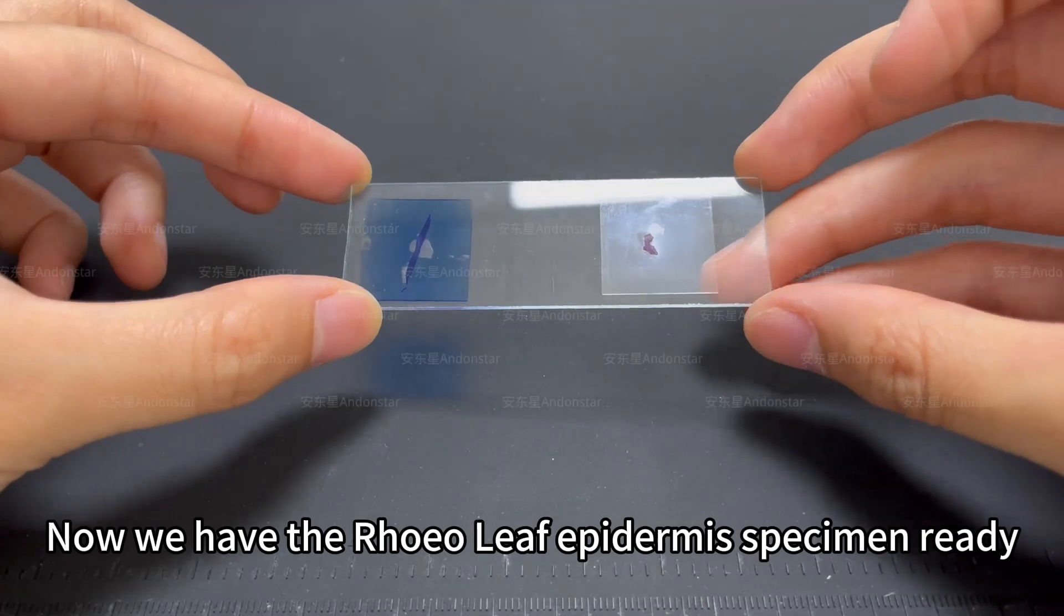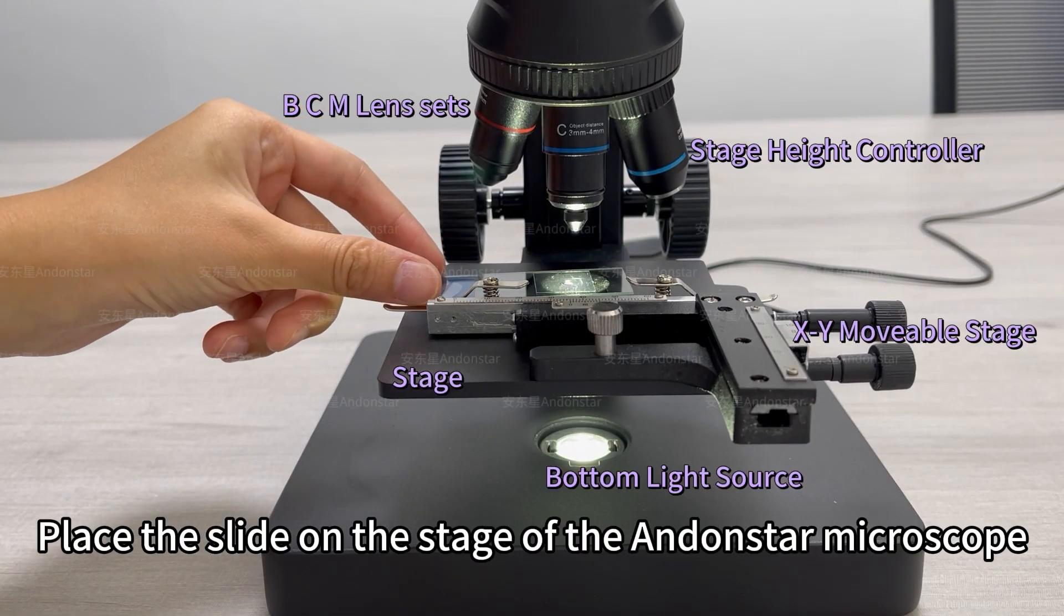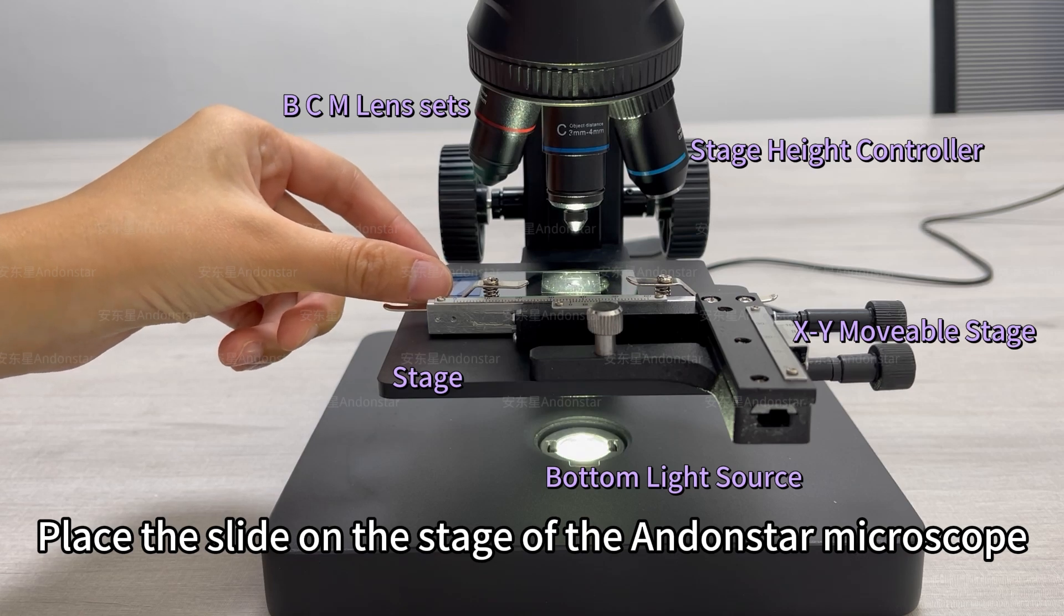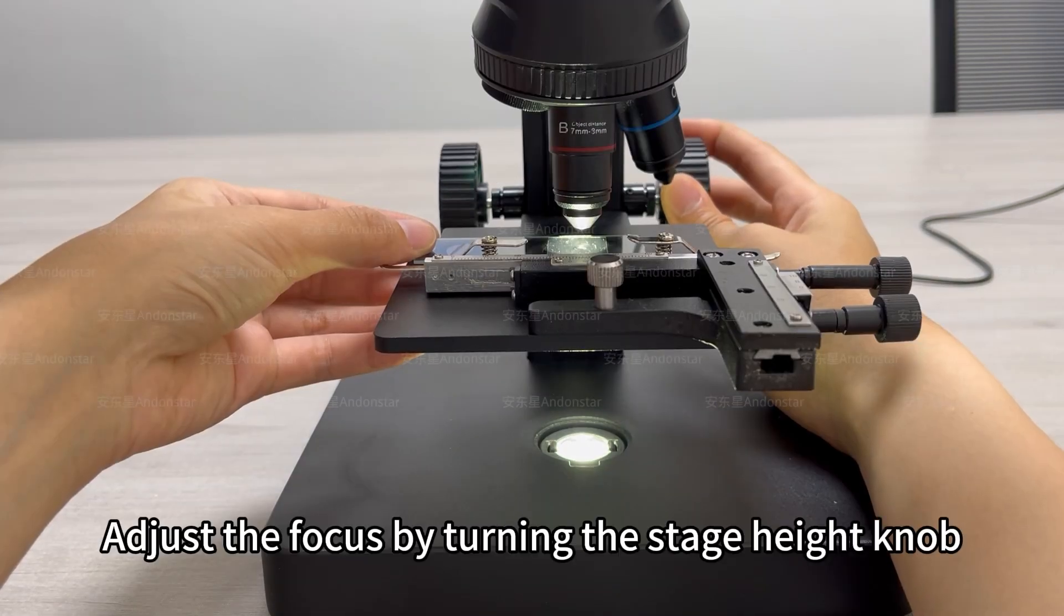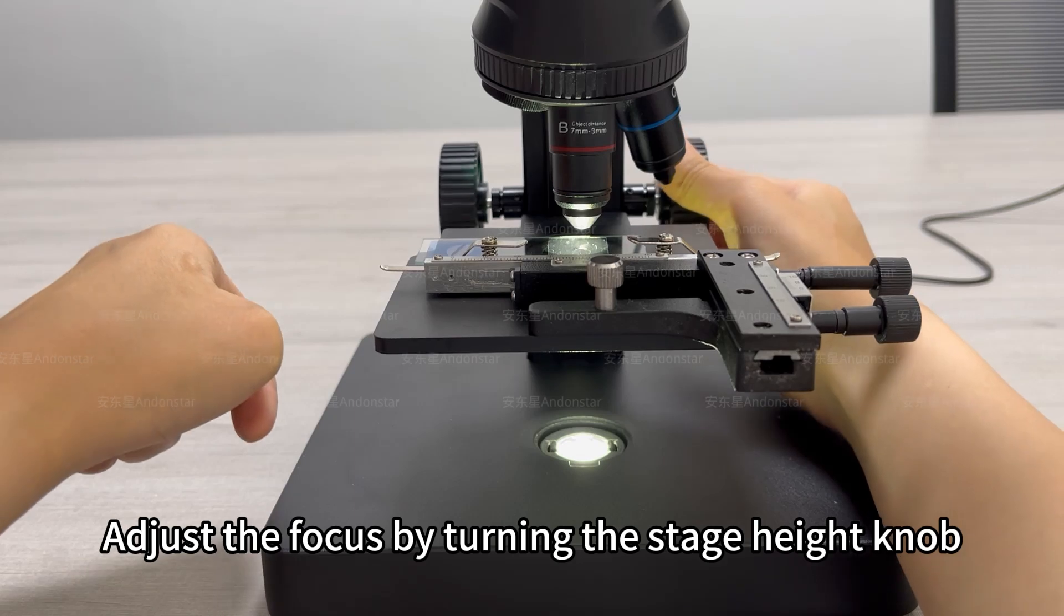Now we have the Rhoeo leaf epidermis specimen ready. Place the slide on the stage of the Andonstar microscope. Adjust the focus by turning the stage height knob.